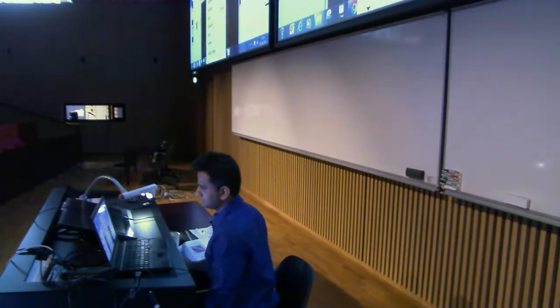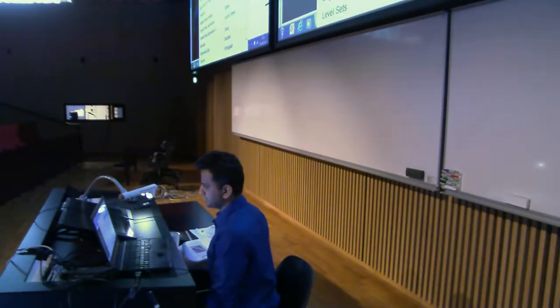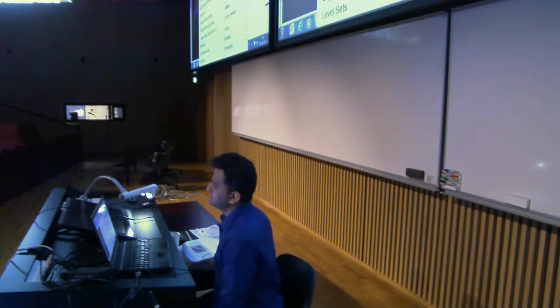Image, type RGB, close it, and then go to plugins. Again, if I'm lost somewhere, I can just press Control L and look for segmentation. But now you see, in the segmentation tab within the plugins, there are this many plugins available to segment your image. Which one is the best?